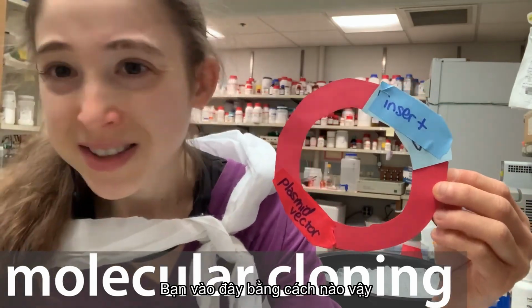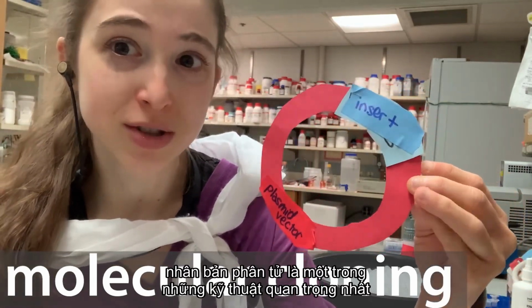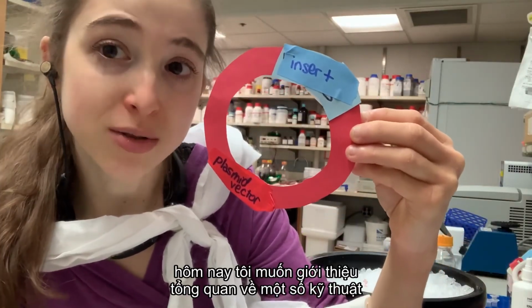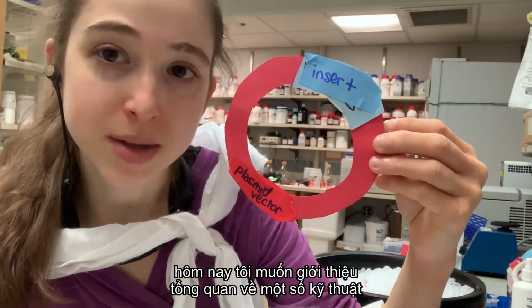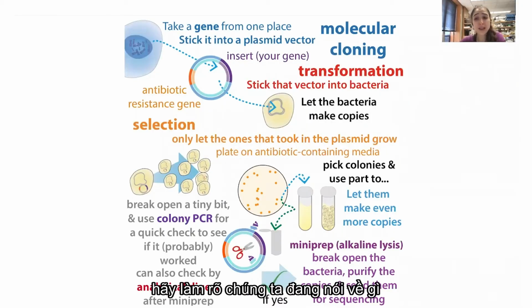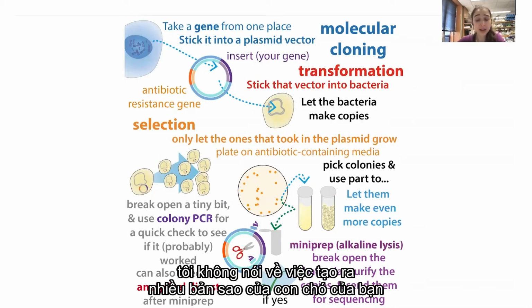So, molecular cloning is one of the most important techniques in molecular biology and biochemistry. So today I want to give you an overview of some of the techniques and the typical workflow. First of all, let's clarify what we're talking about. I am not talking about making a bunch of copies of your dog.